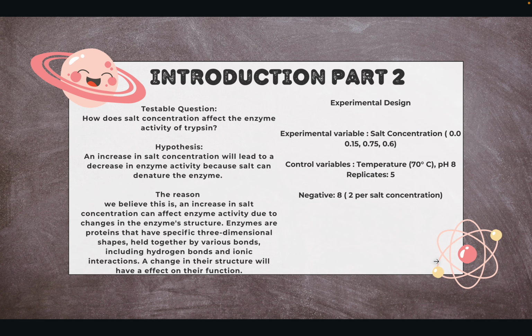Our question for this experiment was, how does salt concentration affect enzyme activity of trypsin? Our hypothesis was that an increase in salt concentration will lead to a decrease in enzyme activity of trypsin because salt can denature the enzyme.